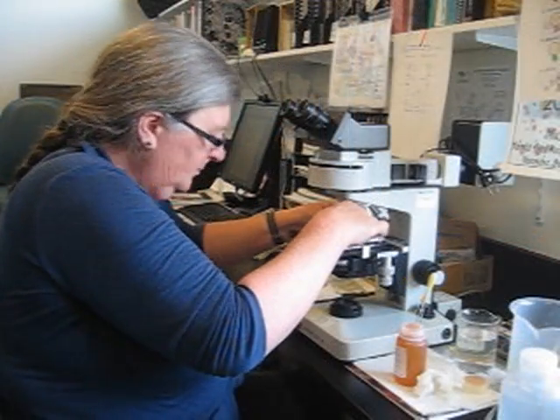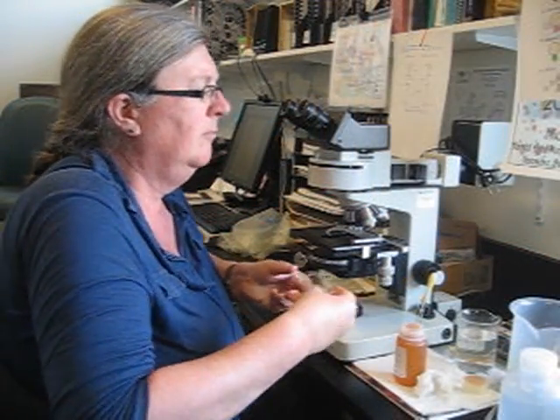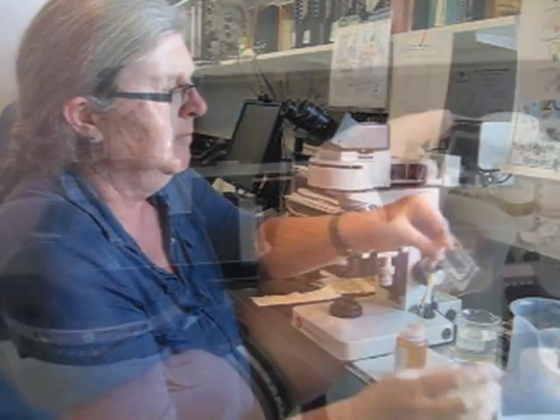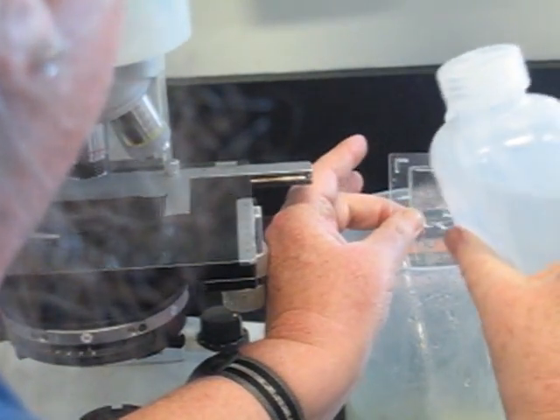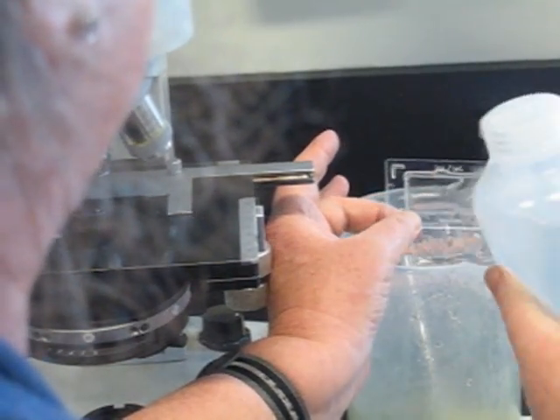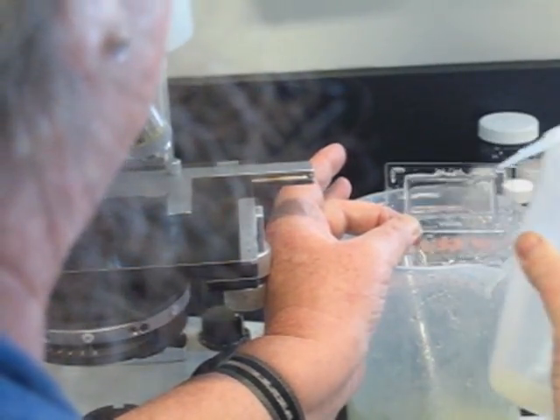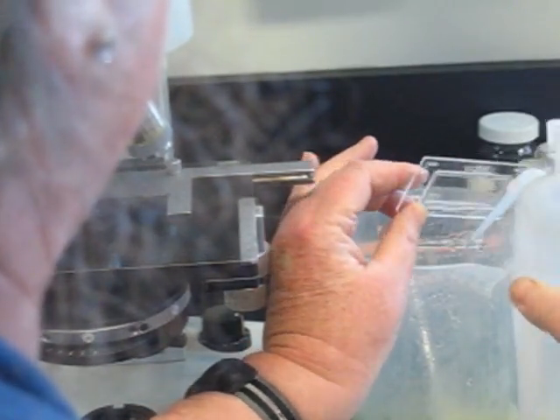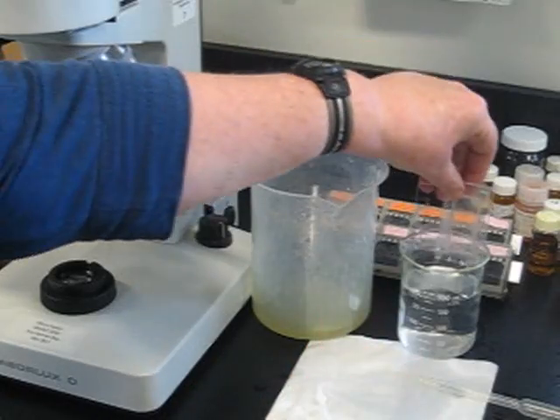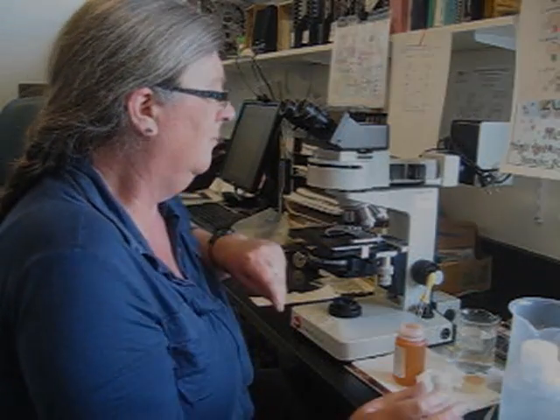When you're done looking at your samples, empty it out and spray it off with a fresh water spray bottle — that gets into all the corners, so it's the optimum way of cleaning off the slide. If you don't have a spray bottle, you can just put it under the tap and then put it back in a jar of fresh water with a bit of soap and/or bleach in it.